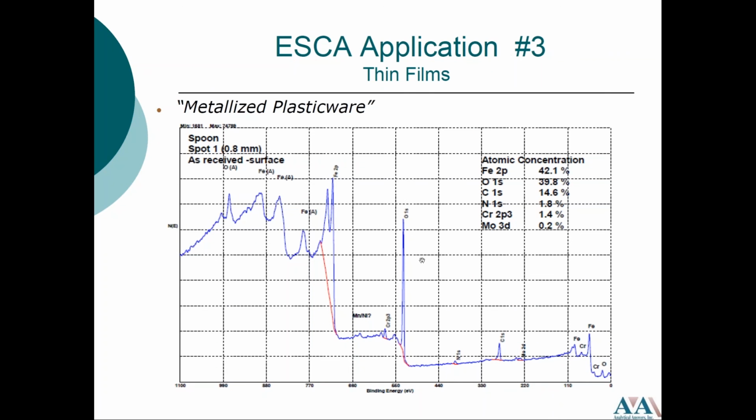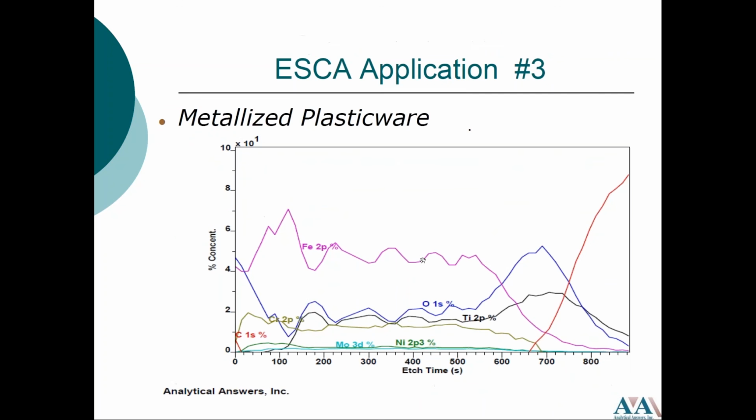Okay, we have another question. Were the dark spots identified in the copper tin line scan example possible voids? They were not. We were just looking at a broad area analysis. Sorry for the fast clicking through. But no, the voids were not analyzed specifically. We probably looked at areas that represented a majority of what those areas looked like. Oh, you're talking about here in the intermetallic region. No, they were not analyzed exclusively.